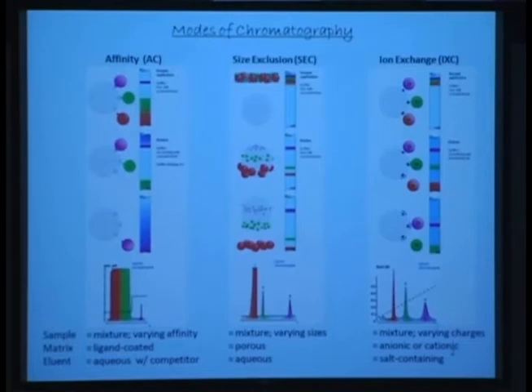Now, obviously, you don't use antithrombin here. In affinity, you use antithrombin in order to purify. But with ion exchange, where you have this matrix with a lot of positive charges, called strong anion exchange, even there, the affinity of heparin is really, really high. So you end up with close to 1 to 2 molar salt concentration, which will be able to release heparin.